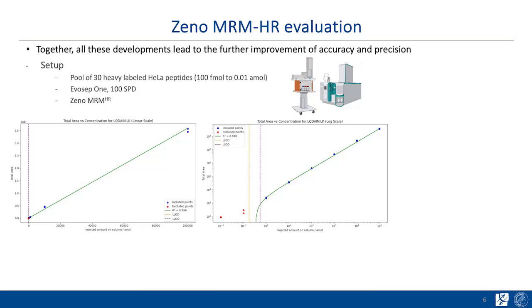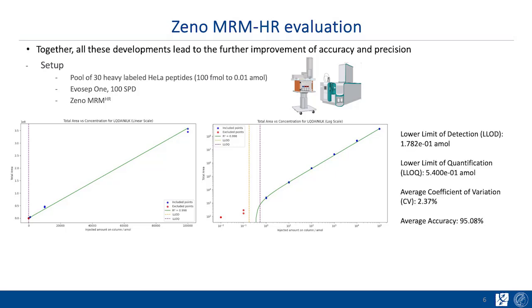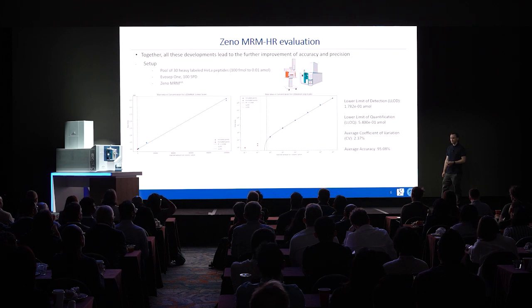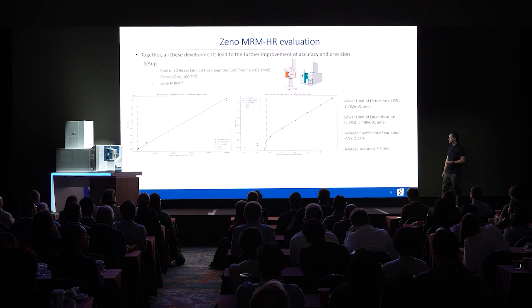And you can see that you can actually detect some peptides down below 1 attomole. And you can also quantify them below 1 attomole, even without having to use the super sensitive Whisper nanoflow setup of the EvoSep. So this is kind of the more robust setup. So it can go even a bit lower at the cost of robustness if you want.